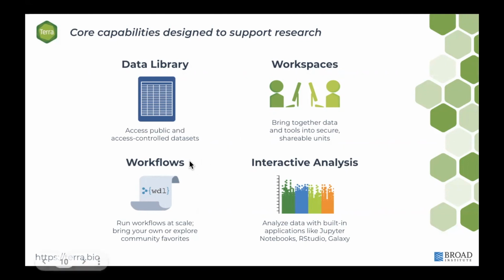You can perform whole pipelines on your data in Terra by running workflows. These are workflows that can scale, and you can bring your own, or you can explore tools that have been contributed by the community. And you can interrogate data in real time with different interactive analysis tools like Jupyter Notebooks, RStudio, and Galaxy.